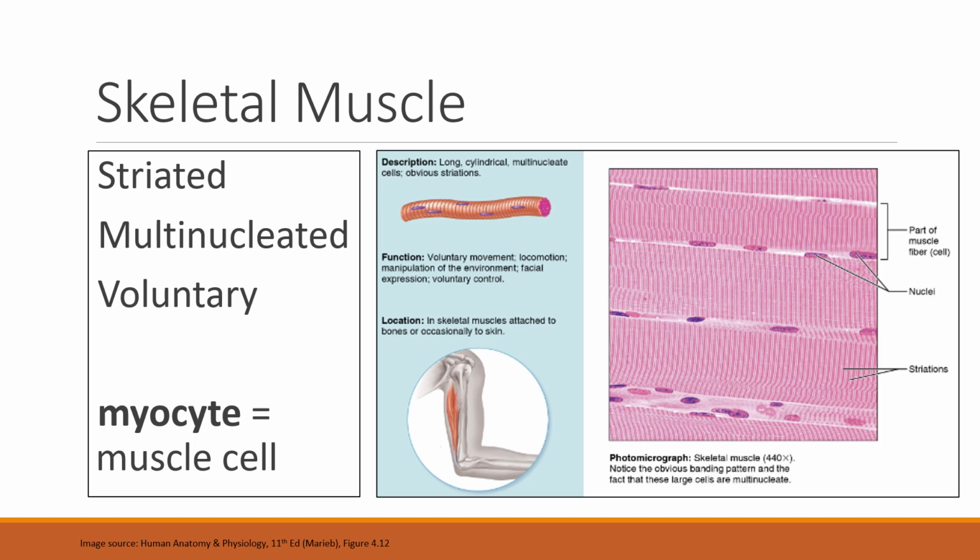But when we're looking at skeletal muscle as a tissue, let's think about a few things. Now, first is this diagram here on the right. This is a picture of a microscopic view of skeletal muscle. You'll see a few characteristics of this, and first is that it's striated. Striated means there's stripes. See how it looks all striped like that? Those are called striations. We're going to learn soon that these striations actually have a very particular purpose when it comes to contracting the muscle or shortening the fibers of the muscles so that your body can do certain activities.